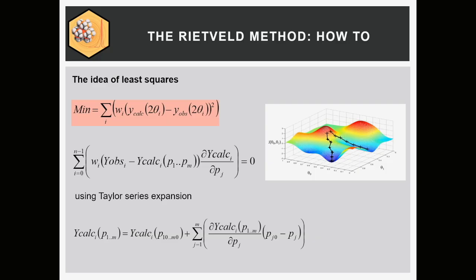Another possibility is you walk down, you end up in a valley which is a dead end, and you see, oh, there's the next mountain. In global optimization, you would jump over this mountain. In local optimization, you're trapped. The only thing you can see is your parameter space, what your 20 parameters see. You only see a little bit around the parameter, whether it goes down or up, and of course you go down.